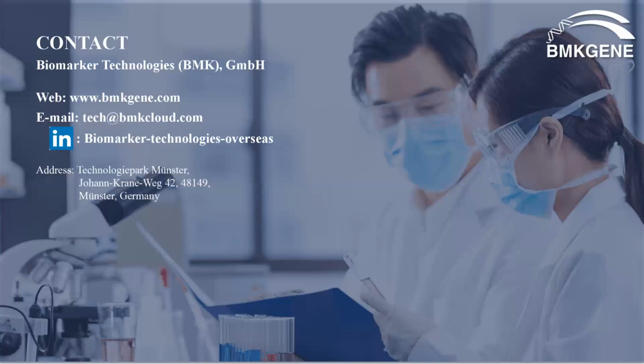Yeah. Okay, perfect. My name is Arvin, and I'm from the Friedrich Alexander University in Erlangen and Nuremberg. I'm working on human cancer metastasis, and we use the zebrafish as a model. I'm curious to know, first of all, we could actually fit quite a lot of zebrafish larvae on a chip, I guess. You said that 2 samples would be possible? Would it be possible to fit even more?